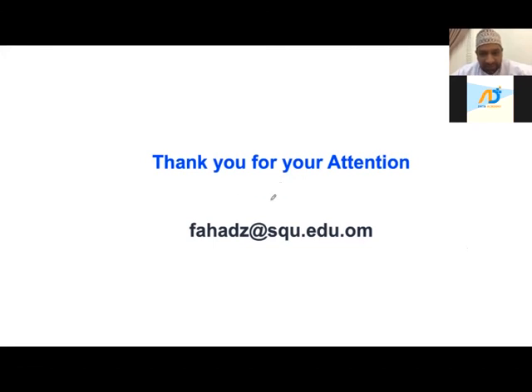Why is it difficult to detect parasites with RT-PCR? It's actually not difficult. The only difficulty is how you do your extraction. If you have a good extraction method, and this is something I need to discuss with people, for example, if you have a sample where the parasite is very low, and I know people who study a parasite in a plant where the parasite is only one copy, when you do extraction, you make sure the parasite DNA or RNA material is also included in that sample.